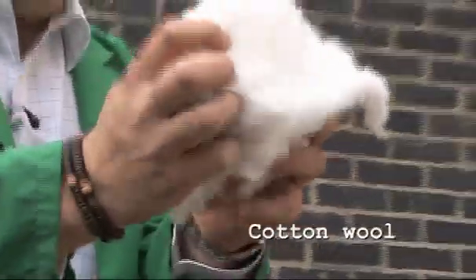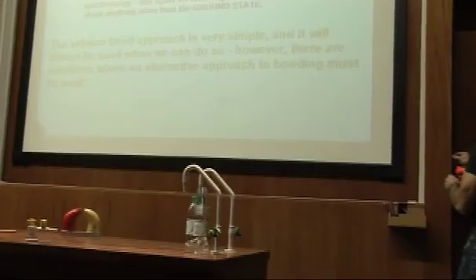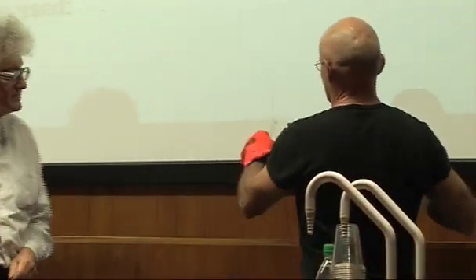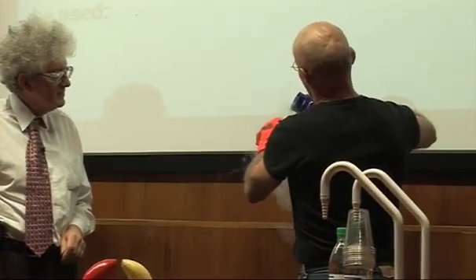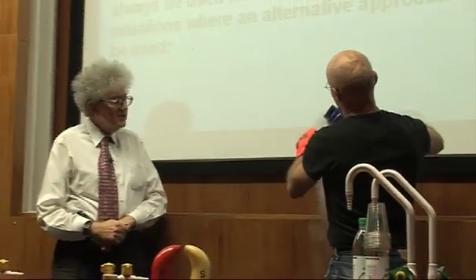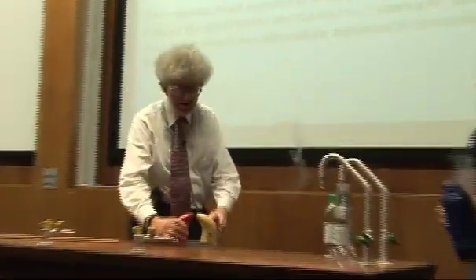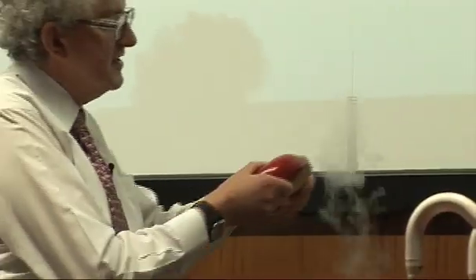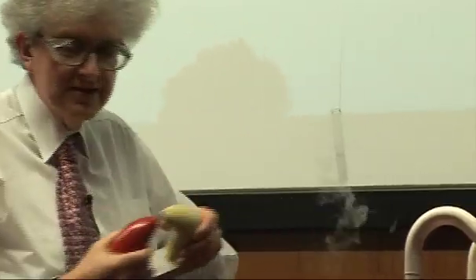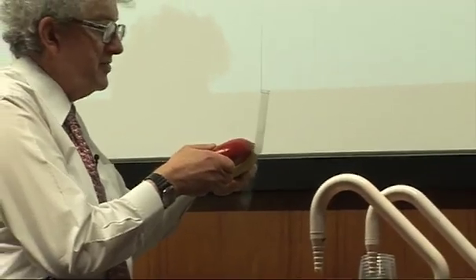Cotton wool is really fluffy — it's not very reactive, doesn't really burn, cinders might smoulder. We're going to pop it in the tray. So we begin with Neil's very high-tech piece of equipment: a test tube on a piece of string. What we're going to do is put some liquid nitrogen in here. You can see liquid nitrogen is colourless. The magnet — which is a pretty good magnet, let me just show you with my keys, they stick pretty strongly — has absolutely no effect at all on the liquid nitrogen.